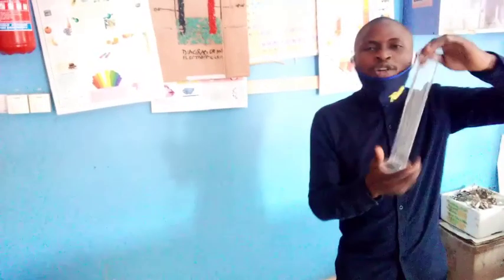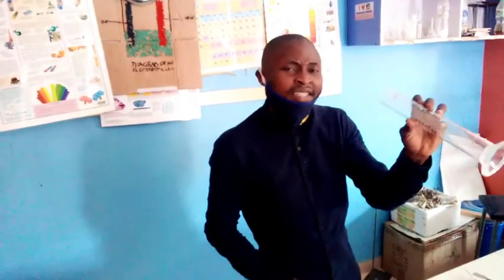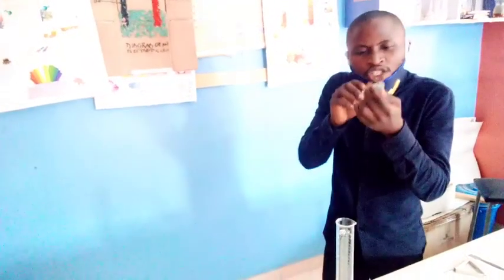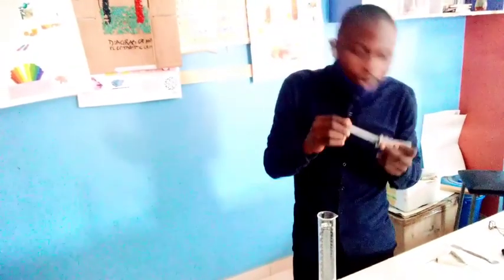Then we have what we call a measuring cylinder. This is used to measure the volume of solutions. Like you can see, they are graduated as well. They are of different sizes. We have that of 10 ml and so on. So it is used specially for measuring volumes of solution. Then we have a gas syringe. As the name implies, it is not what you call a syringe in the medical industry. This is what we call a gas syringe in chemistry. It is mainly used for collecting and measuring gases.